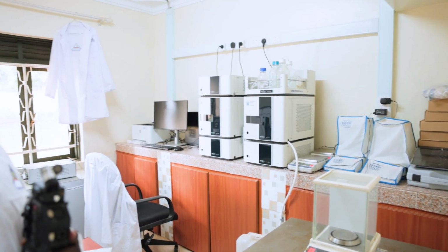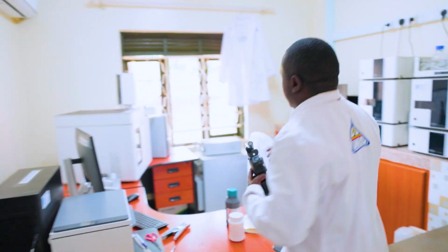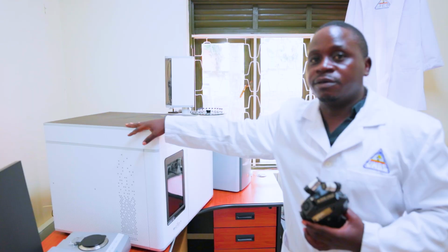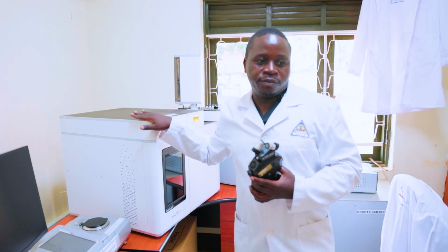We do HMF in honey. We also have the GC. This one we do methanol with. Remember, recently we did methanol analysis in alcoholic beverages. This is the one we use for that.